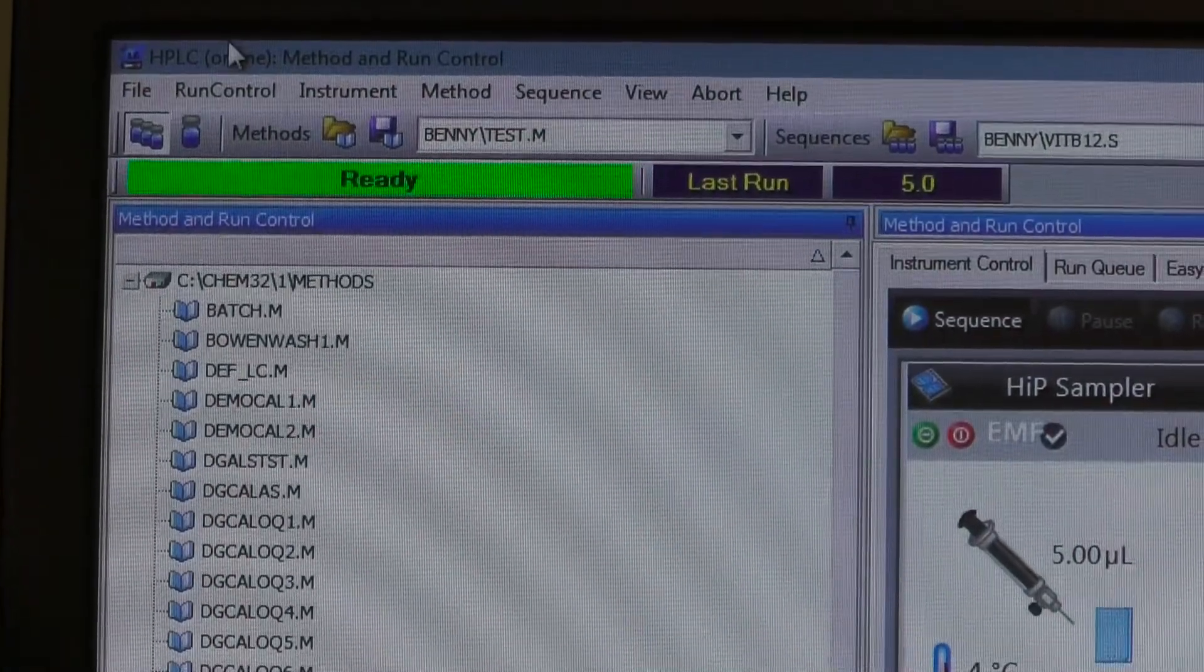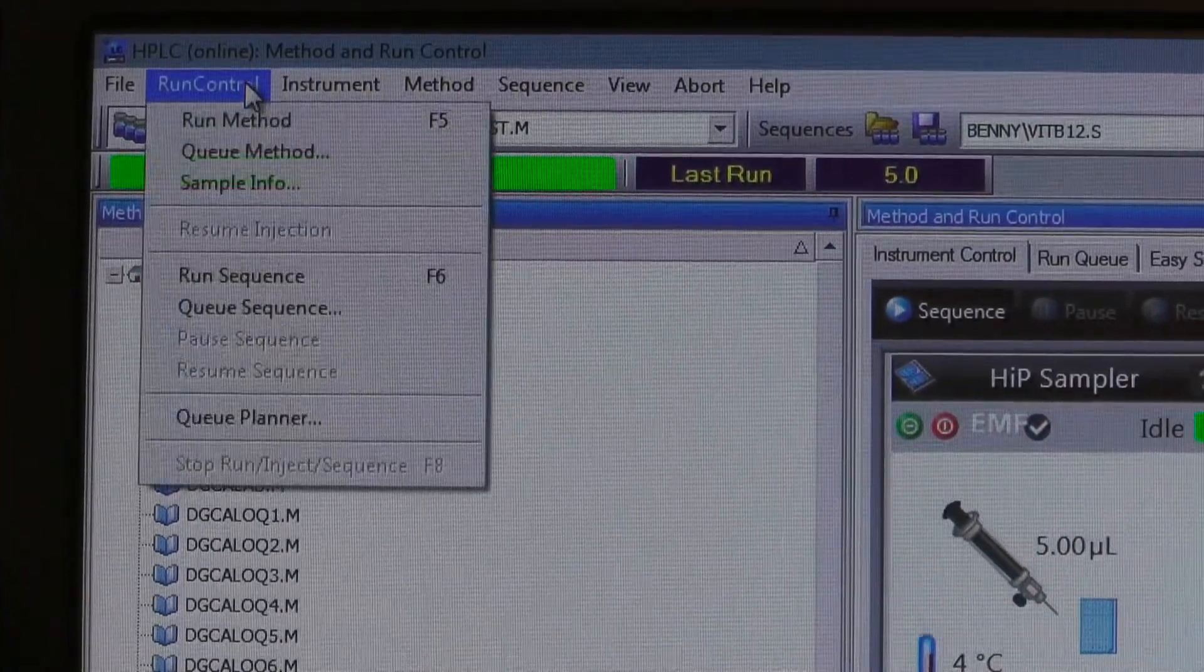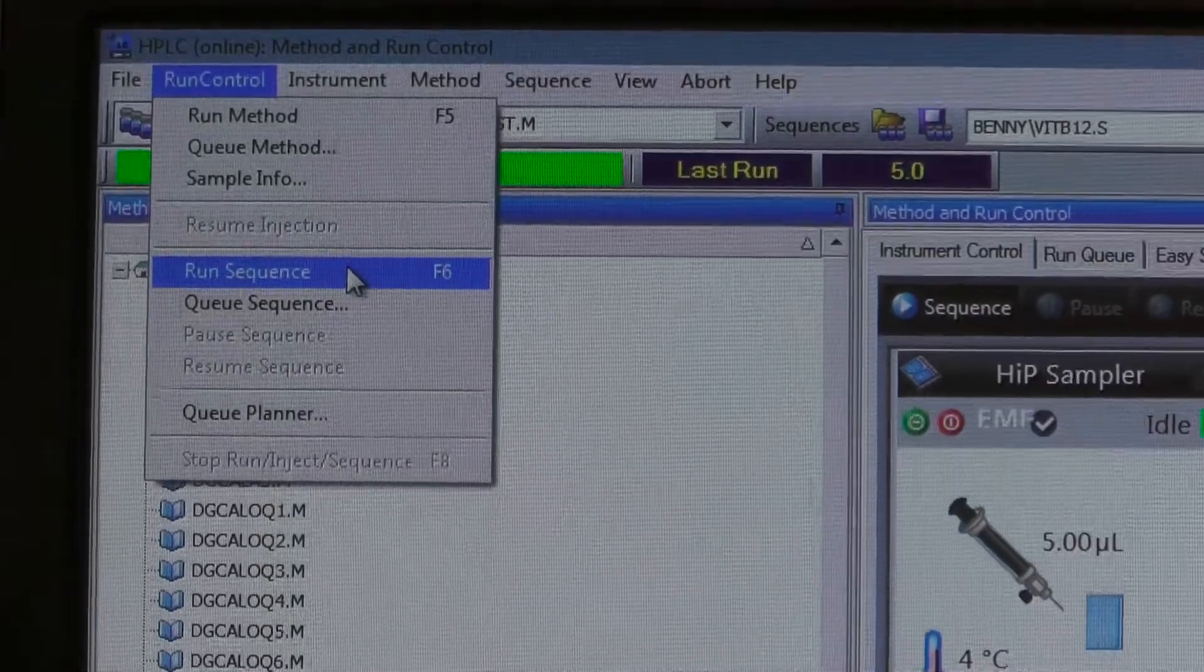Click on Run Control Tab and then Run Sequence. The Auto Sampler will start injecting your samples.